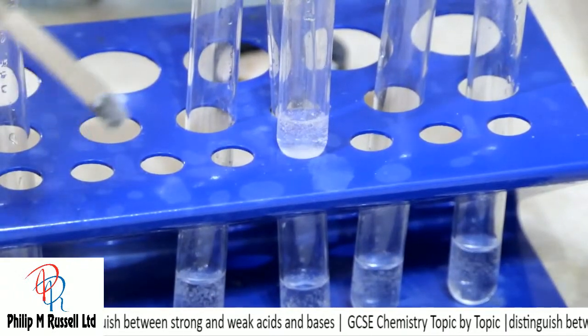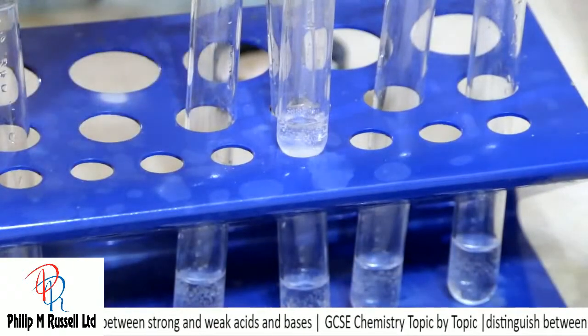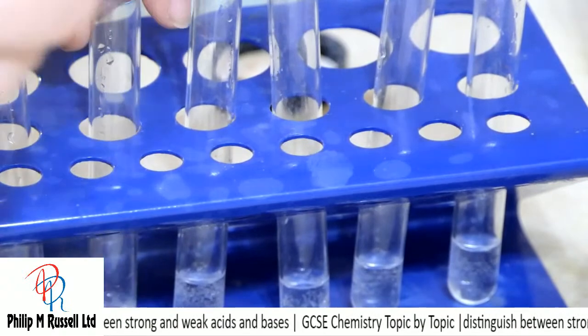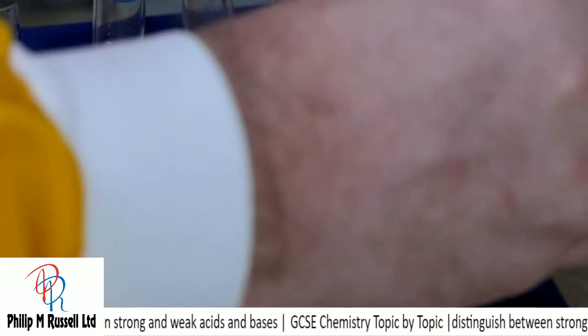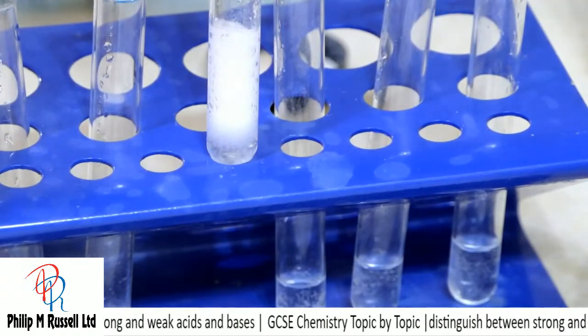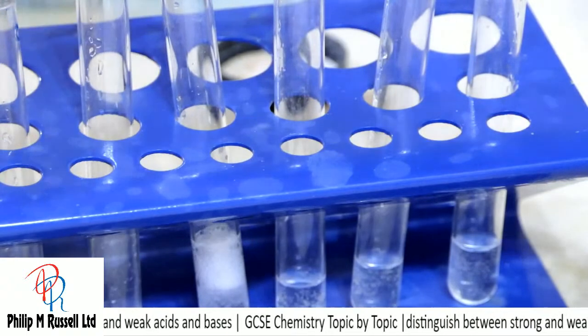Well, did you see that? Was there less fizz? Compare it with the 1 molar. Definitely a little less reaction.